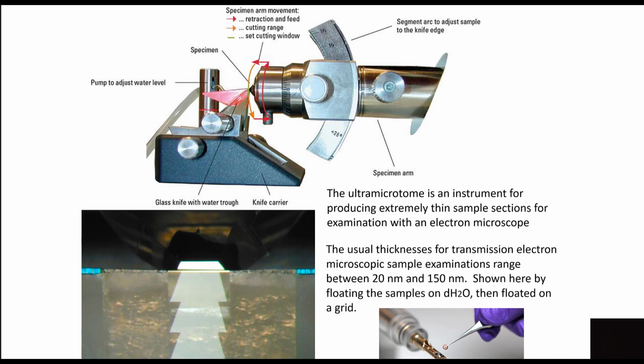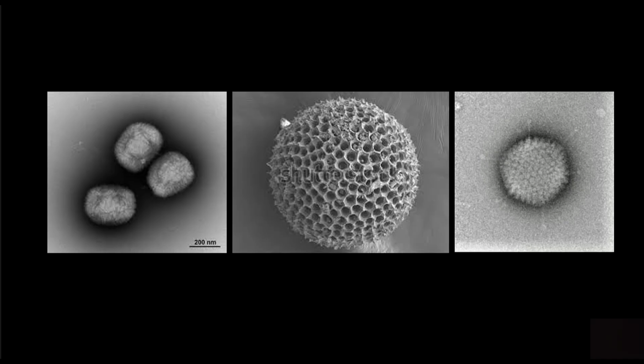and then put that on. That's like the stage that we use on a light microscope, but this is for electron, and that little stage fits onto that. It's a little grid that we use for that, and then you have about 30 seconds before your sample gets fried. So be prepared to spend many hours. Did I mention many hours? Many hours.